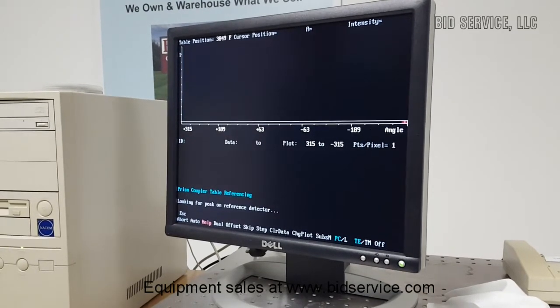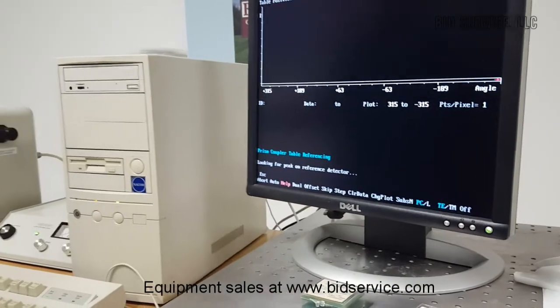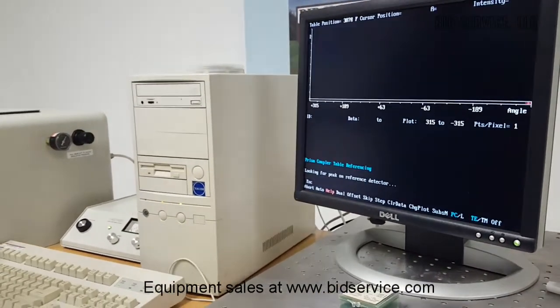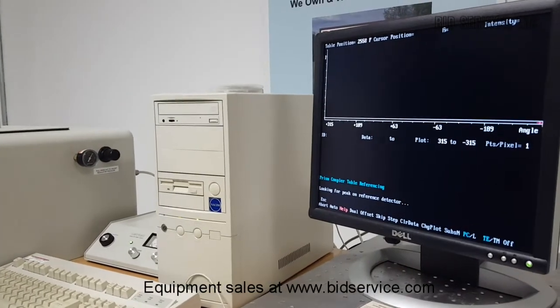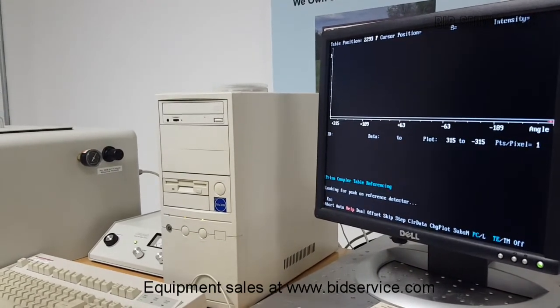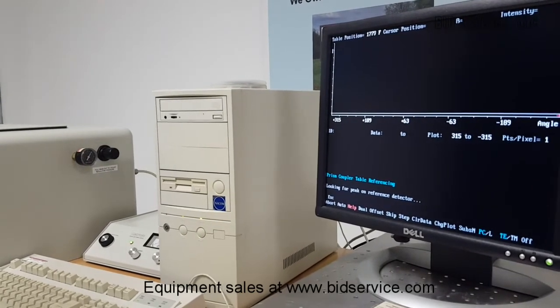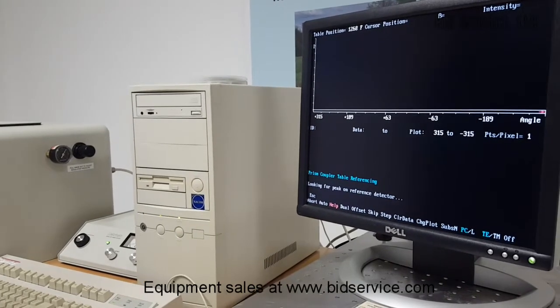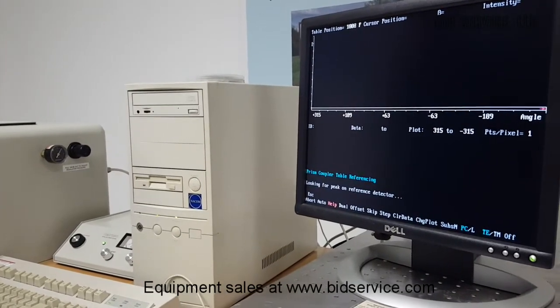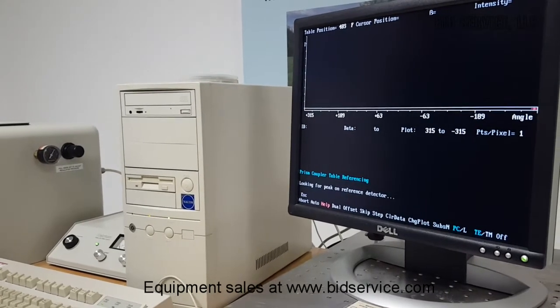All the cables connected to the main system, the interface box and PC will be labeled and marked, and all the cables will be disconnected for shipping. The green ground cord should be properly connected for the system to function properly. And in case the signal is lost or anything, first make sure the connectors are firmly connected.